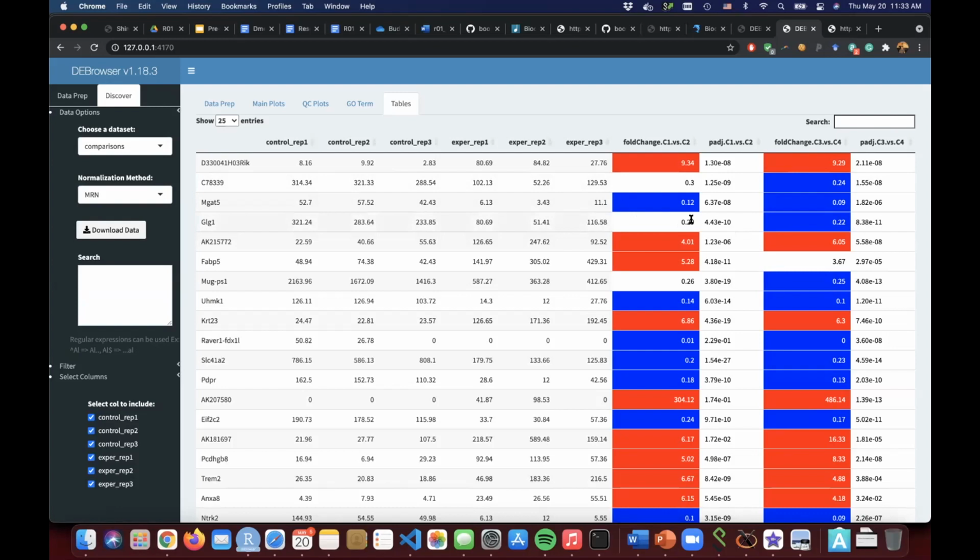And here it's more than 0.25, and still significant, very replicable when you look at the normalized counts. But when you have 3 replicas, it's not in that cutoff that you are using. Or sometimes some of them are not even significant.